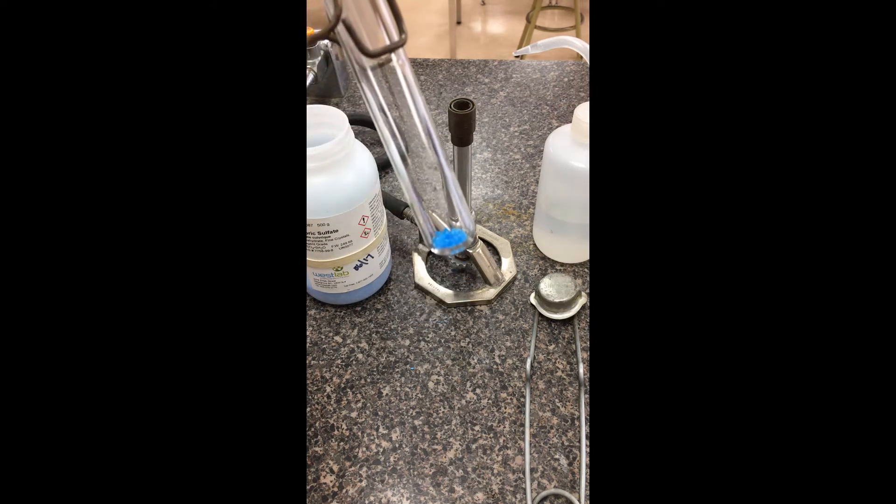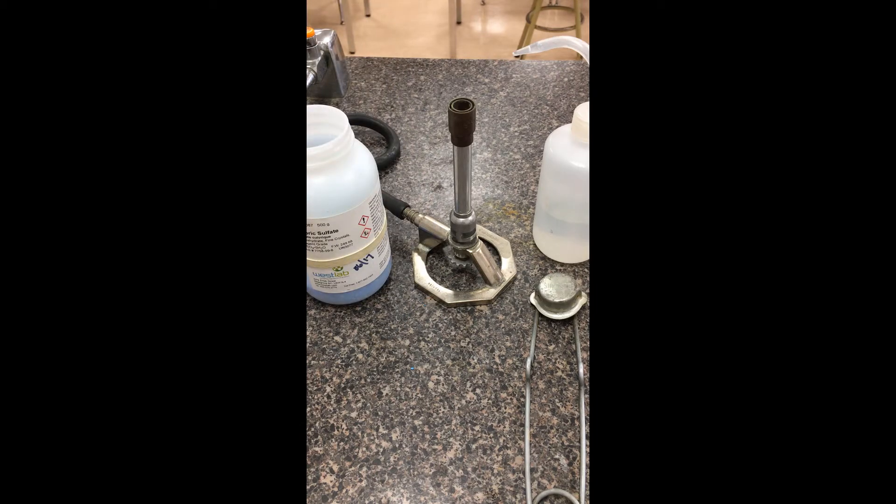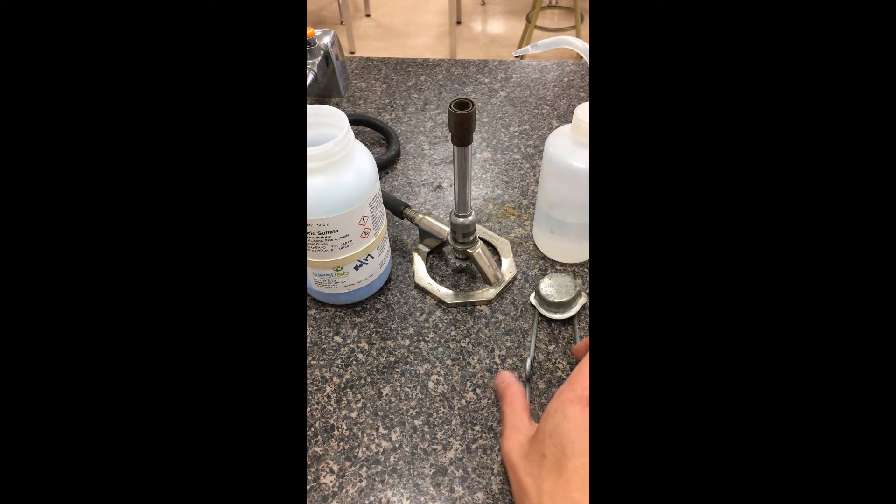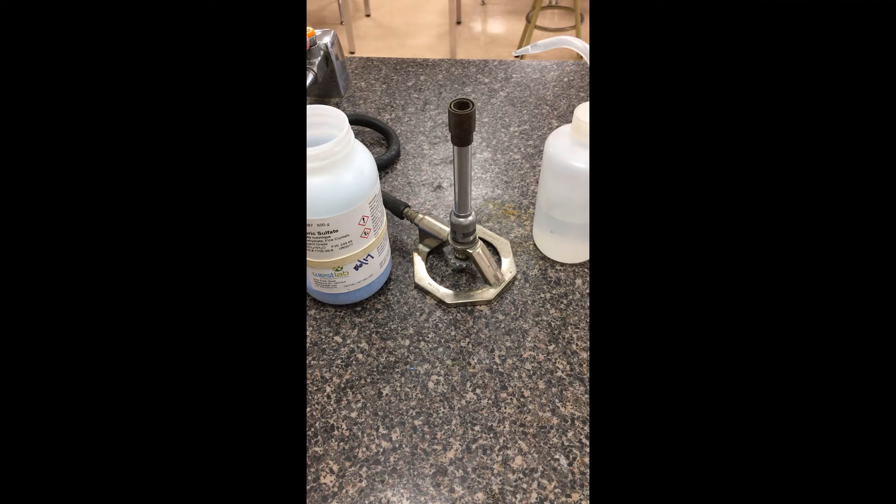What we're going to do is strike the Bunsen burner, use the heat from the Bunsen burner to try to evaporate off some of the water, and then we're going to just make some observations. For this station in particular, I want you to focus on whether this meets the criteria that we need for an equilibrium system compared to what we've learned in the chapter so far.